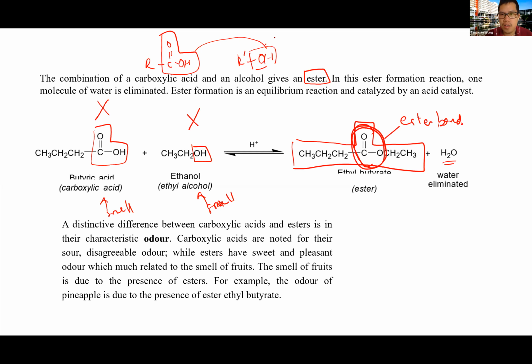The reason, as I mentioned, is that after the reaction you don't smell directly. You need to take the top part out first into a new test tube, or dilute it, because sometimes the smell is too overwhelming and you cannot differentiate it.